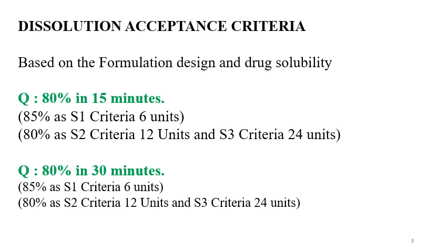But if the formulation is not showing release of 80% or above in 15 minutes or 30 minutes, then it might be a problem of API solubility, or it may be because of low API solubility. Then you can go for surfactants and you can use other media as well.